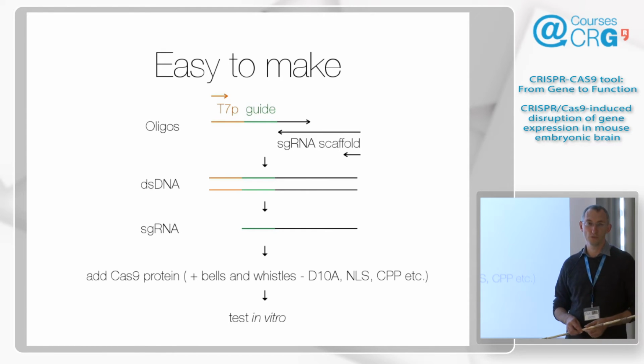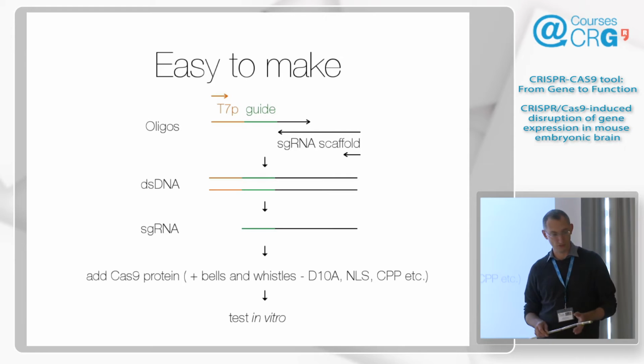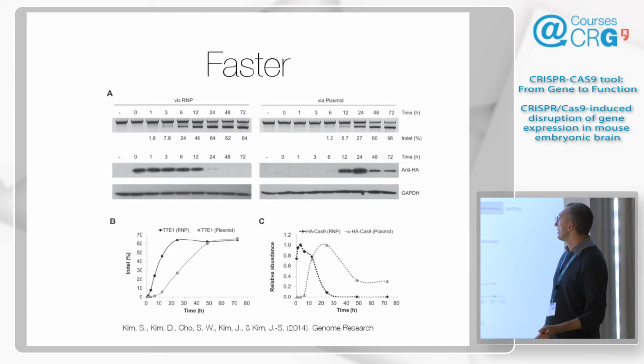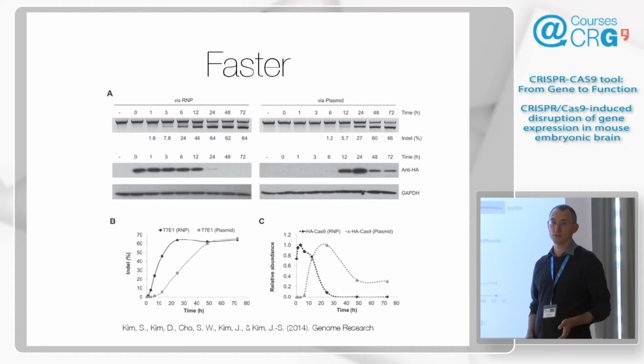It's also now possible to buy synthetic guides, and we do that. There are several companies that are competing now. The prices are going down, so this is really nice. They're also chemically modified to be more stable, and the companies make various claims. I don't know to what degree they're relevant, but they're convenient to use. The very important point here is that it is faster because there's no delay in terms of time for transcription, translation, folding, and so on. You put it in, it works.